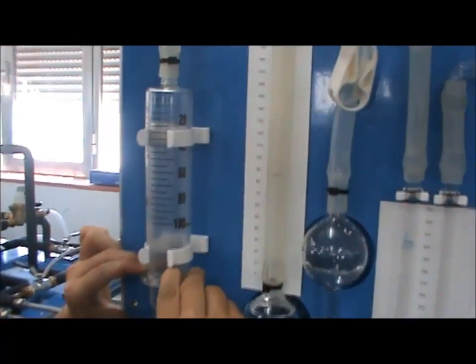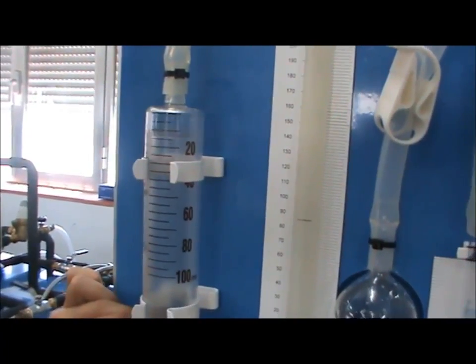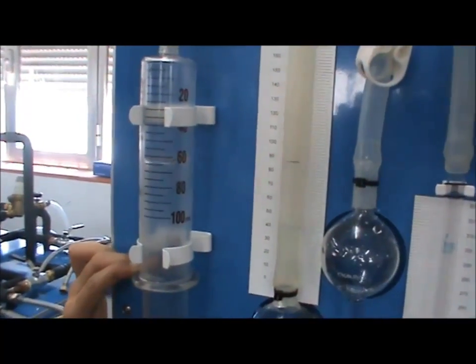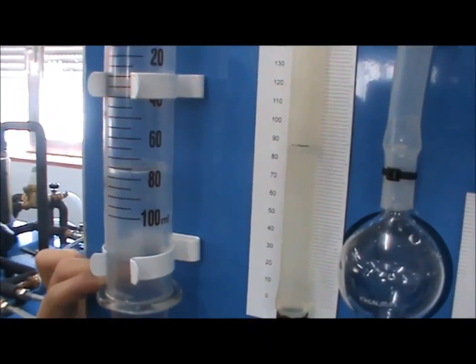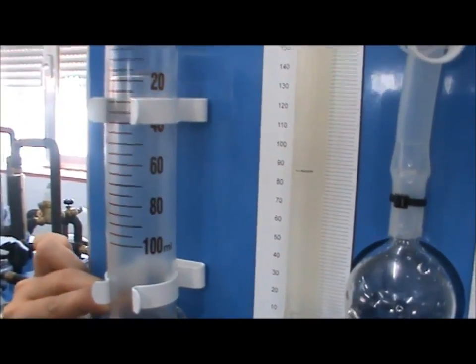Continue this process until you are able to easily compress the plunger, and the volume reduction in the syringe is constant. Now the absorption by the KOH solution is complete.